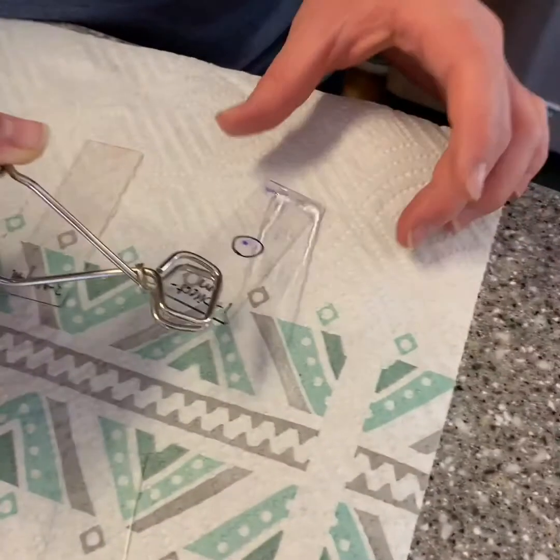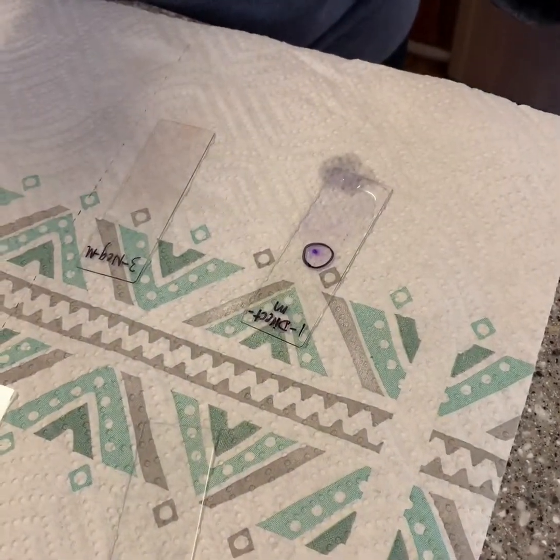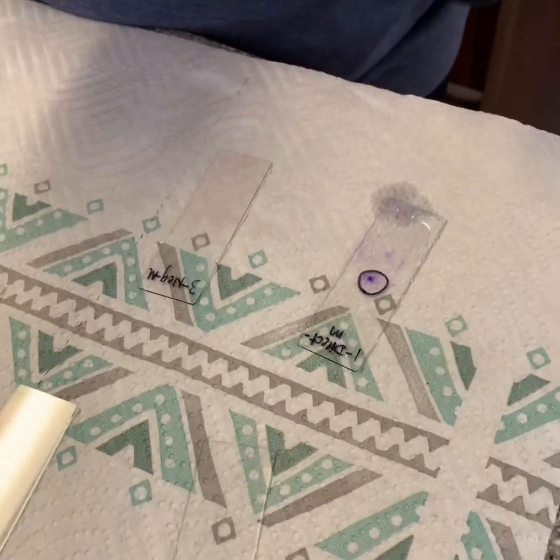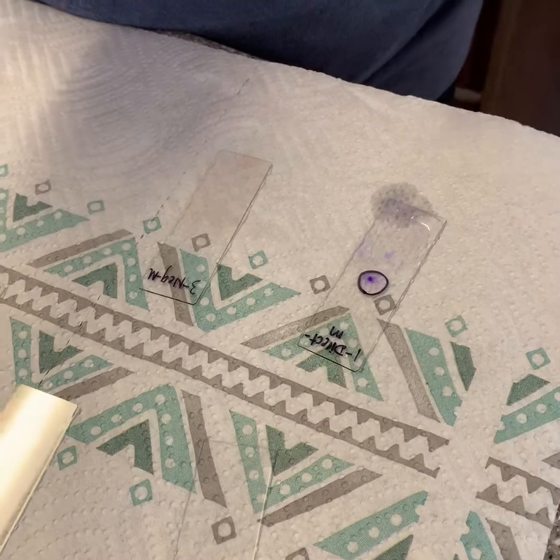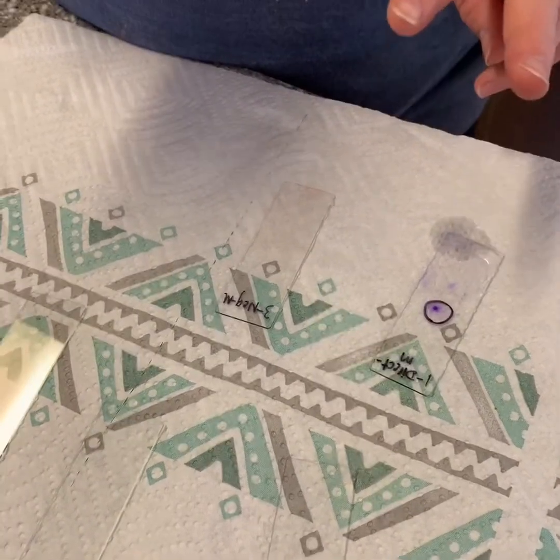Now I'm going to blot that and let that completely dry before I take a look at both of these slides underneath the microscope, and that is exercise one of bacterial morphology and staining techniques.